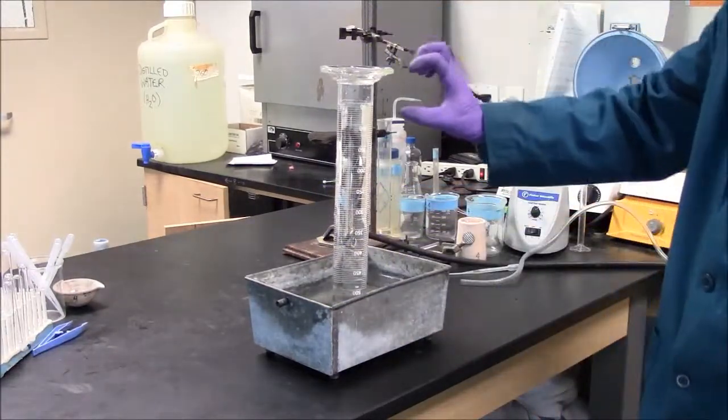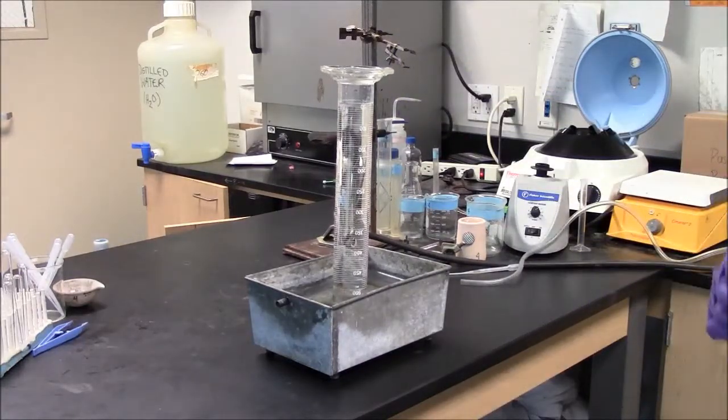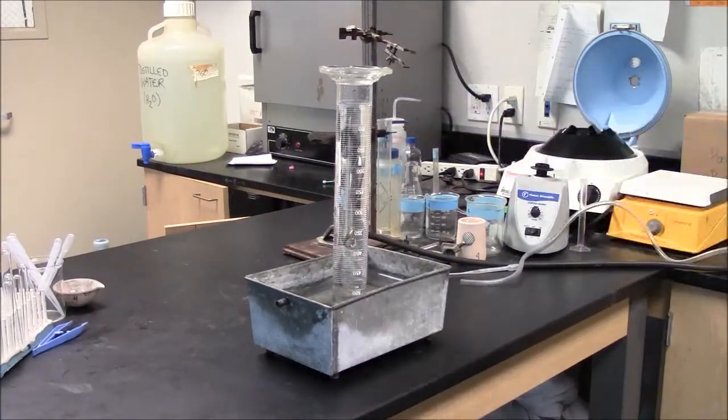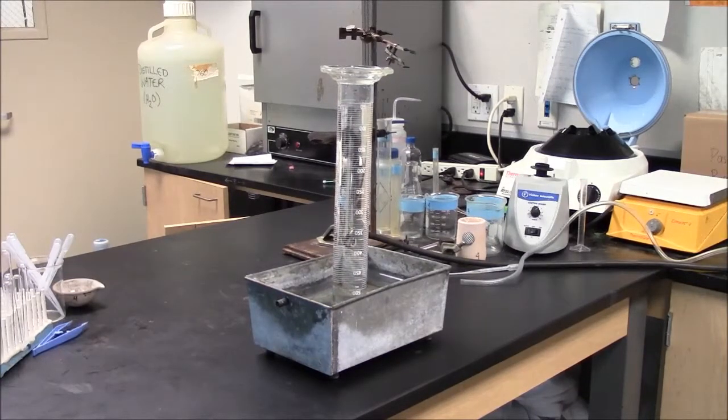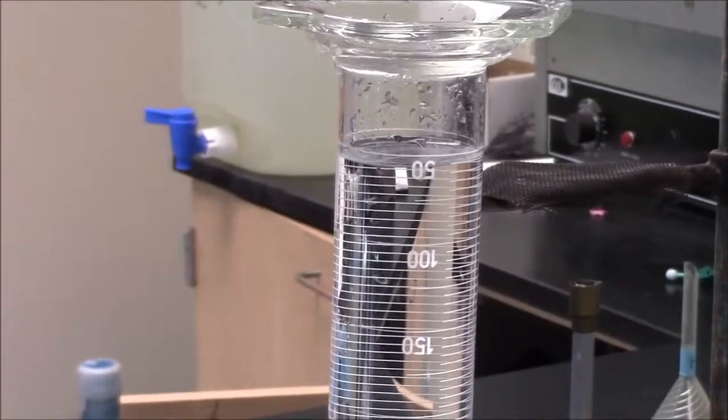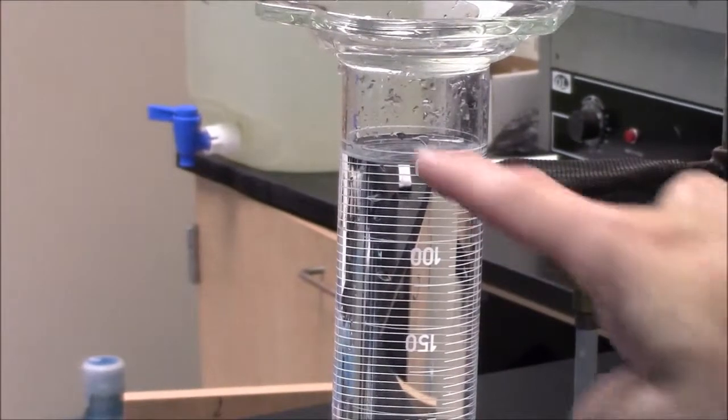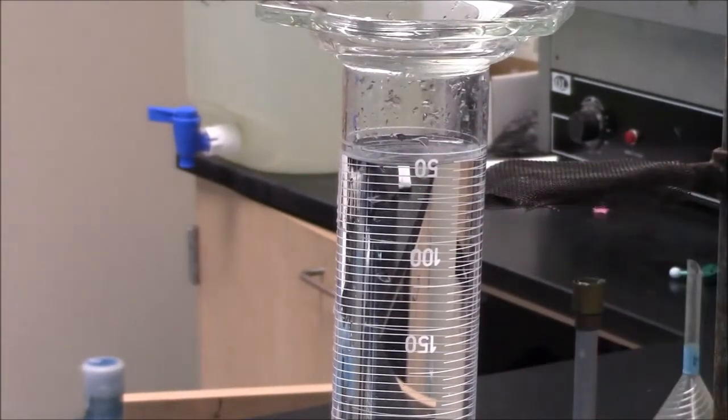I have some air space at the top. It's not a problem as long as I can read the volume of air already in the cylinder. When you read the volume you have to read the bottom of the curve. It's called a meniscus.